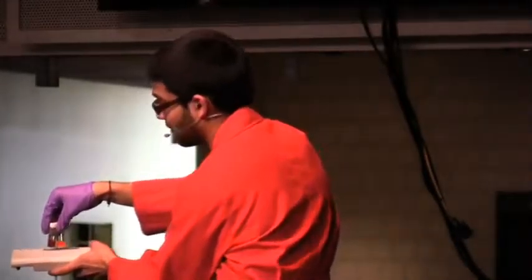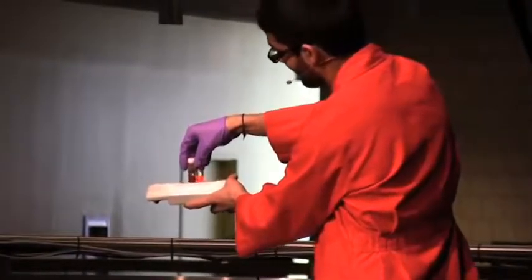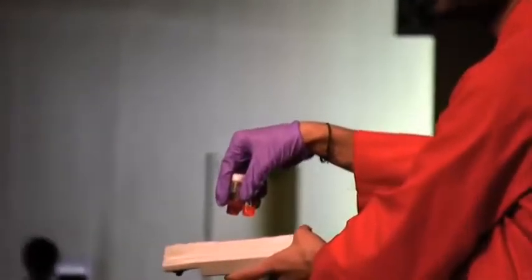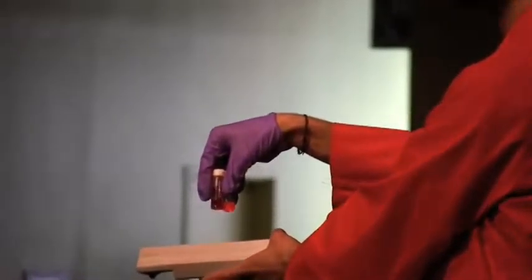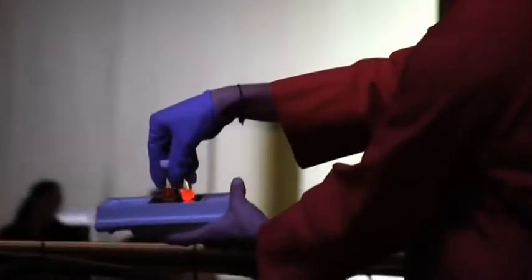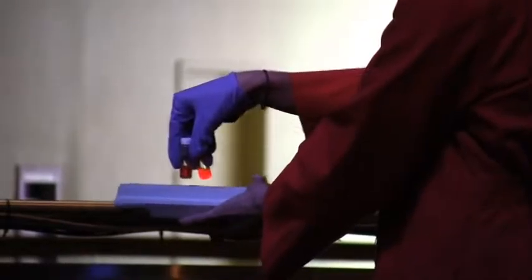Okay? I see they both kind of look red. But when I put them under the actual UV light, when I start pumping them with energy, and it might be hard to see with these lights, but basically the quantum dots will actually be a lot brighter. And I think Alex is helping me with the lights here. But you can see that one of them is clearly a lot brighter than the other. Okay? And the one that's a lot brighter is the one that is actually undergoing fluorescence.